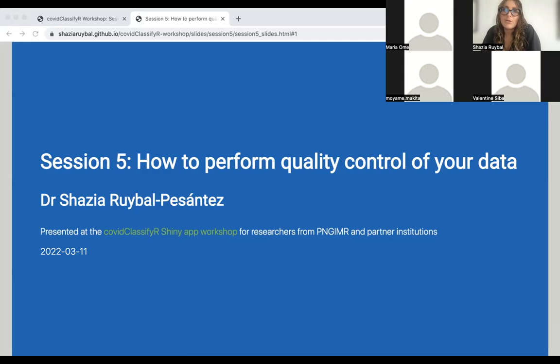I do have a section in the tutorial that's troubleshooting. But I was thinking of making a frequently asked questions section, and I'll pop these questions there, with some suggested answers as they come. It was a bit difficult because we've been developing this for a while, but as we discuss them, I'll pop them there so that you can always go back to that. And then the next session that we're going to go through is session 5.